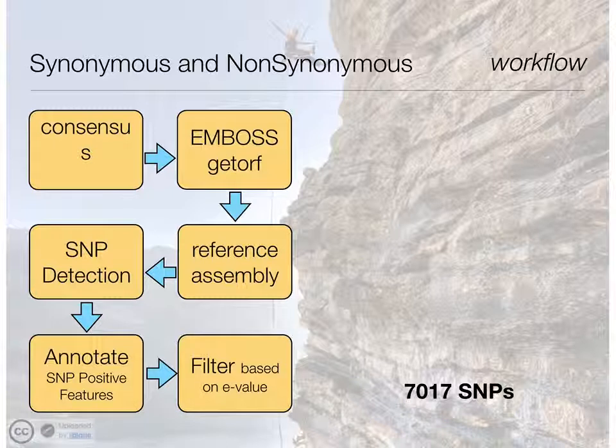So we've made fake proteins based on open reading frames. Then if it BLASTed as something, I would have been more confident that it was a real protein. That's what I mean by filtering on E values. It had to have a big open reading frame and a very strict E value, and then it was likely to be non-synonymous. There are different ways to do it now, but hopefully this makes sense conceptually of how I went through the pipeline.